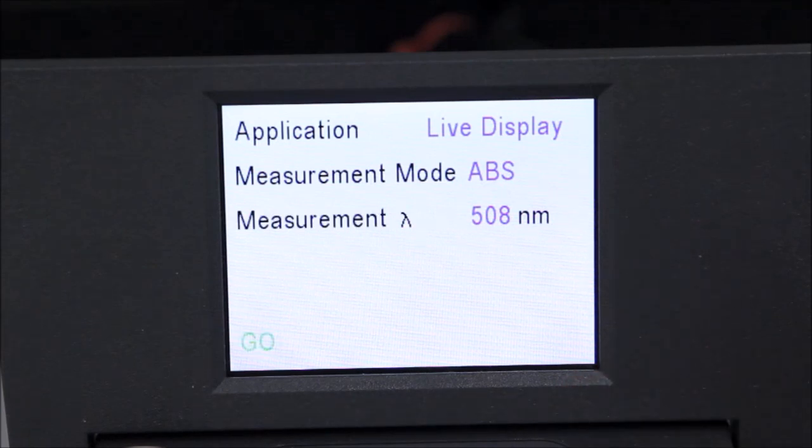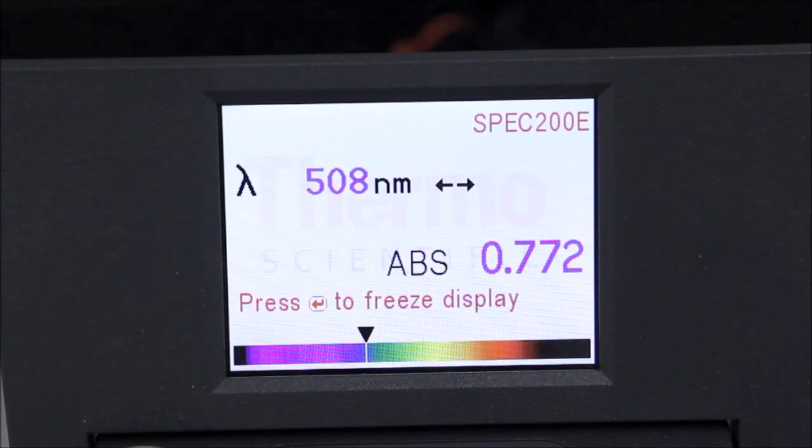This application gives us a real-time reading of the absorbance of our solution at one wavelength. This is especially important if we expect the absorbance of our solution at that wavelength to change over time.